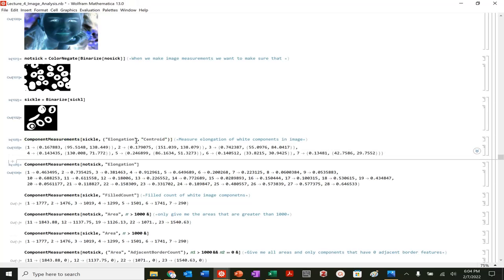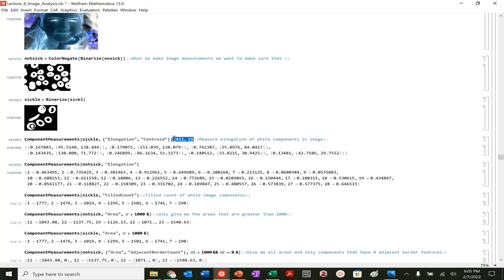So for here. So what I can do is I can start to basically look at and grab some of those values. So for example, let's look at this. So I can go ahead and grab all two. So for example, we can start doing lots of cool things with this.